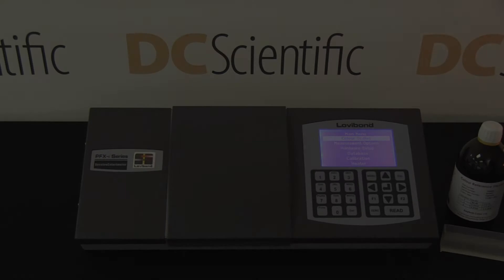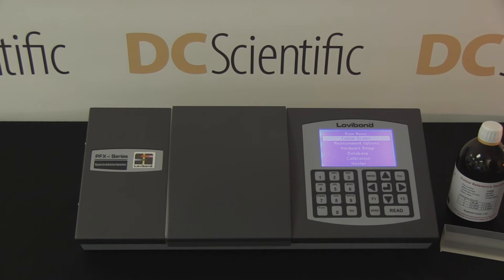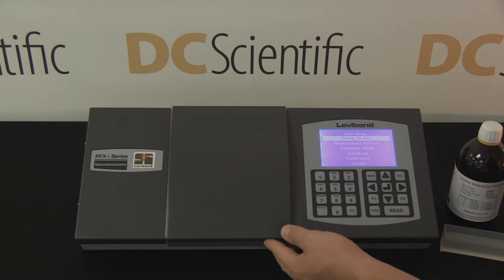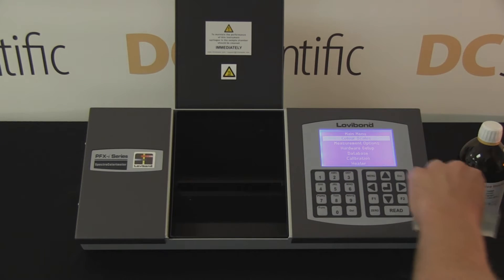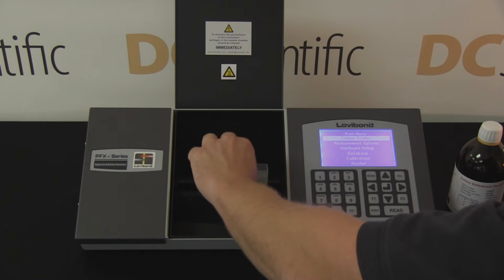DC Scientific presents the Lovabond Tentometer PFXI995P for determining ASTM D156 Seibold color. To demonstrate the accuracy of the spectro colorimeter, the technician performs the test using an ISO 17025 certified standard with a Seibold value of plus 10.